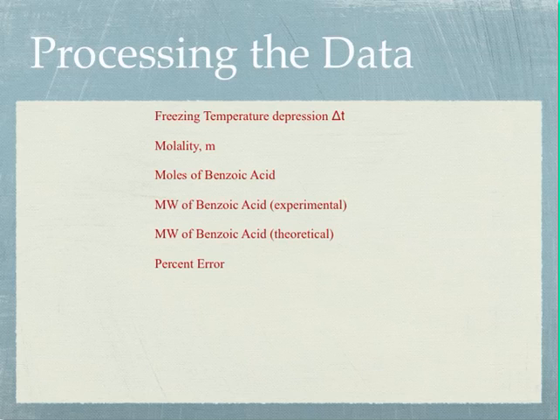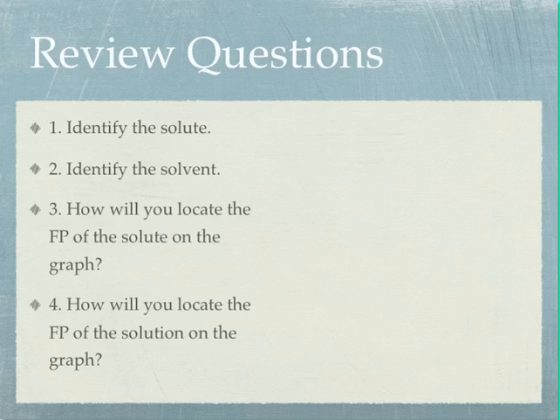What I'd like for you guys to do as you're getting ready for this is to write the answers to these review questions down on a sheet of paper or on your lab sheet, which is fine. Identify for me the solute, number 1. Number 2, tell me what the solvent is. Number 3, tell me how you're going to locate the freezing point of the solute on the graph. And then finally, number 4, tell me how you will locate the freezing point of the solution on the graph.